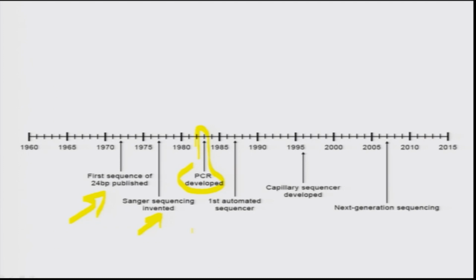But the invention of the PCR approach changed the way Sanger sequencing is done, because now you can amplify, meaning make millions of copies of any small region of the genome, and this PCR product can straight away be sequenced. So, that came to be called cycle sequencing, using the PCR approach to sequence the genome. That has led to what are called automated DNA sequencers, where you set up the reaction and leave it, and the sequencer machine runs, deciphers the sequence and gives you the data.